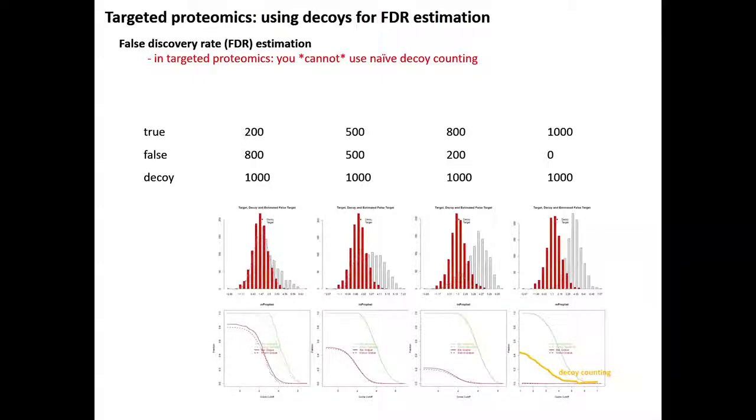So decoys are usually fine. As long as you have a relatively good decoy generator that doesn't bias for anything, the decoys are usually fine. The problem is the ratio of false and true targets, and Isa will comment heavily on that.